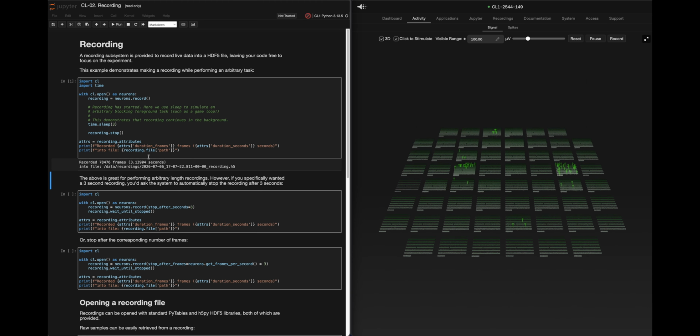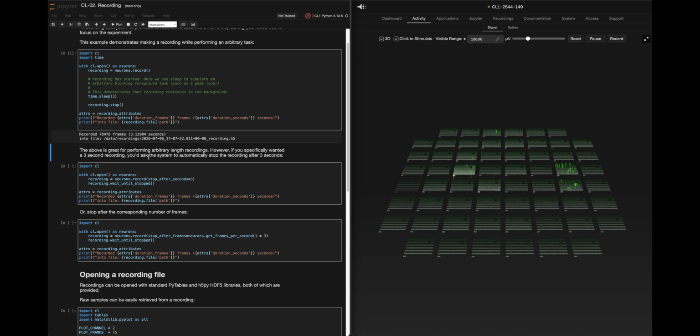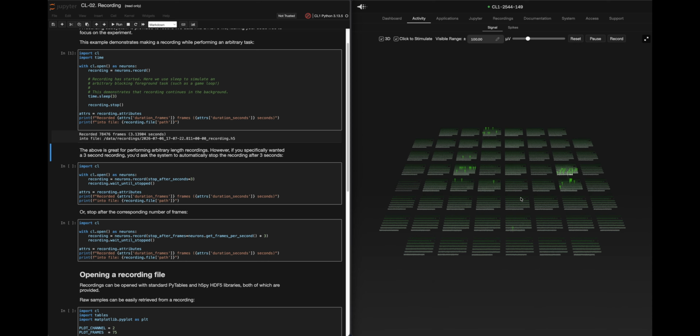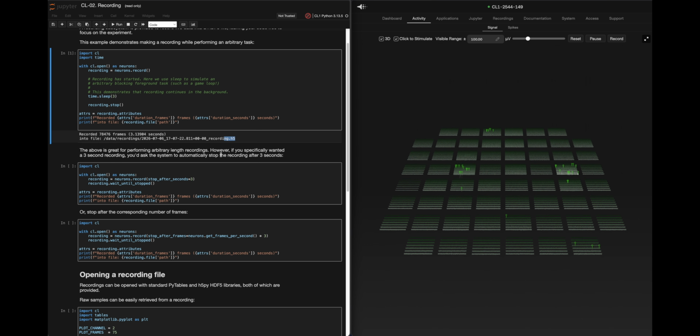This is probably one of the most useful things when you are coming in and working with this platform. I just got done, on this exact machine that you see here, on a 10-hour run, doing some stimulations and having to ensure that I know how I'm going to improve my code after the fact. You'll see .h5 here as well. So the format is H5. You can convert that to something else later on if you need it, and we might go over that in another video, but I highly, highly recommend you work in the HDF5 format.